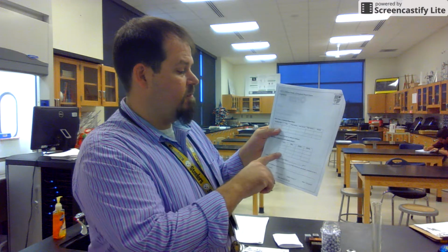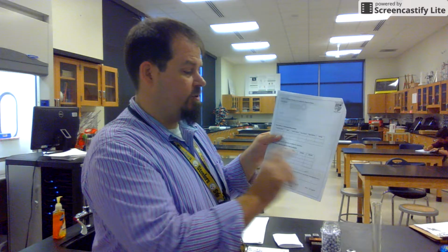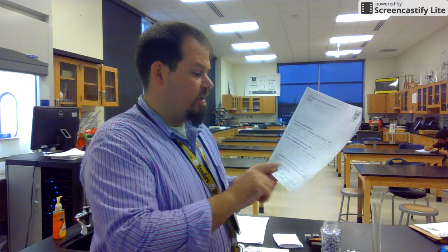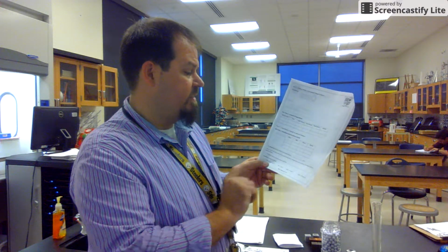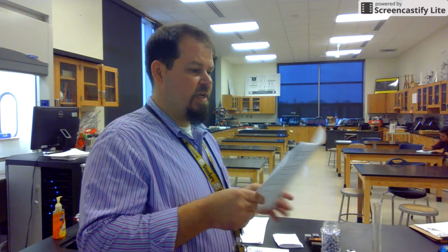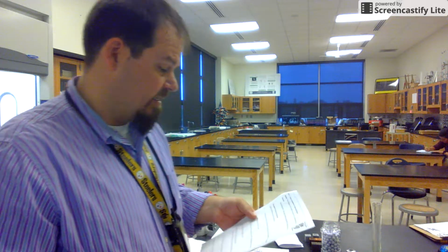I want you to use your three trials. So if there's two people in your group or three people in your group, I want you to do it separately again, like you did the wood block. Average your answers together. Your average density, we're going to apply to these and figure out what your unknown metal is most likely to be. It's going to be the one that's closest. It will not be exact, and that's good.